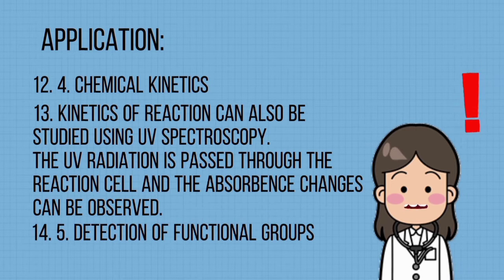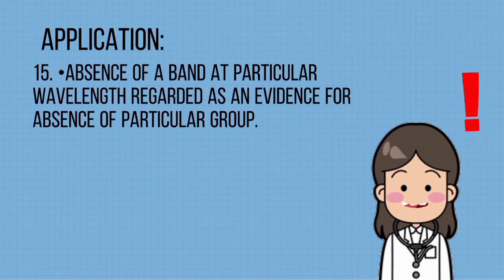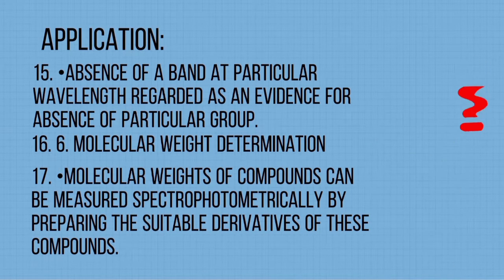14. Detection of functional groups. 15. Absence of a band at a particular wavelength is regarded as evidence for absence of a particular group. 16. Molecular weight determination. 17. Molecular weights of compounds can be measured spectrophotometrically by preparing suitable derivatives of these compounds.